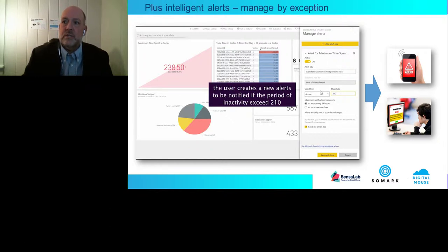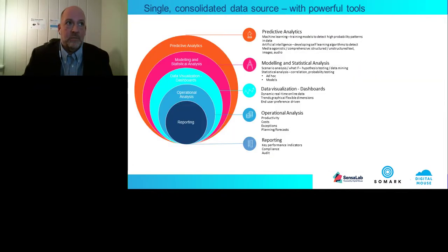We propose using data visualization tools. You can gain insights into your data quicker. Tools such as Power BI or Tableau enable you to set alerts when they detect anomalies in data, preventing your research going out of control, losing animals to ill health unnecessarily, and will save you time and sometimes the value of your research. If your data is locked in paper notebooks or files on servers or even files uploaded to an electronic lab notebook, you will struggle to develop reliable analytical insights.